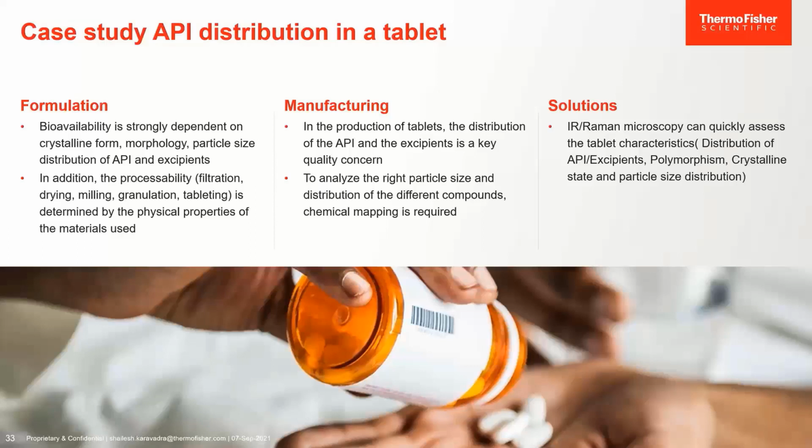Here we want to show the example of tablet imaging for analysis of the distribution of API in a tablet. It offers the possibility of identifying different molecules of API and excipients using Raman microscopy. Moreover, the tablet can also be measured confocally to look at the depth profile of the API or excipients. With Raman imaging, the dosage form and the API distribution can be shown in detail in the distribution image.